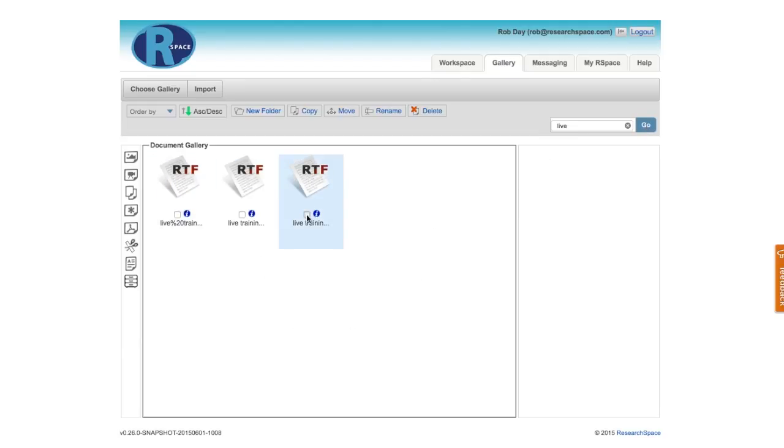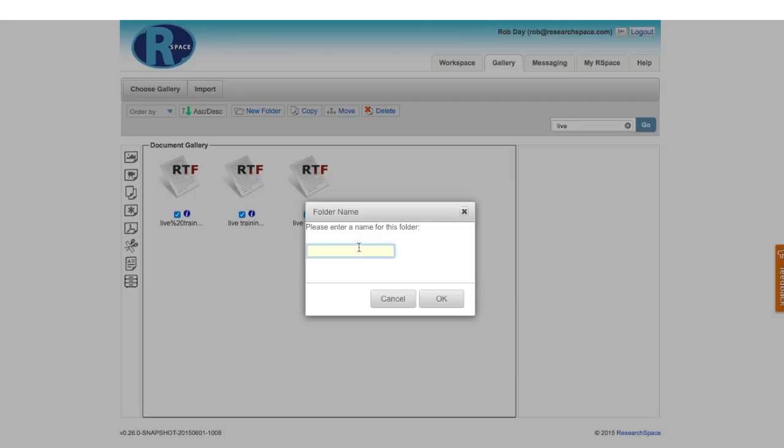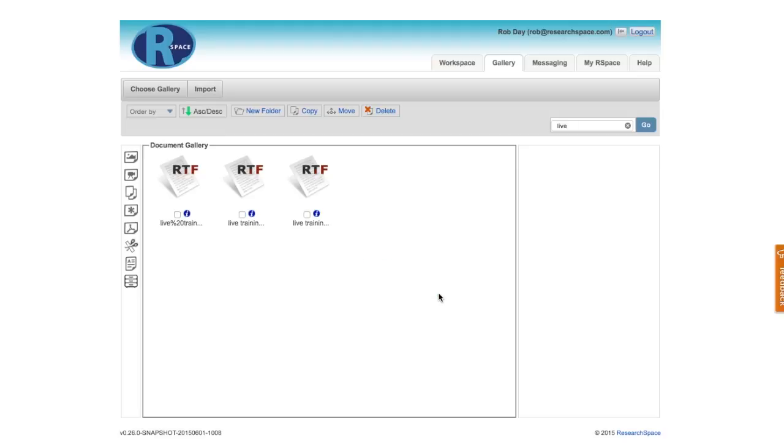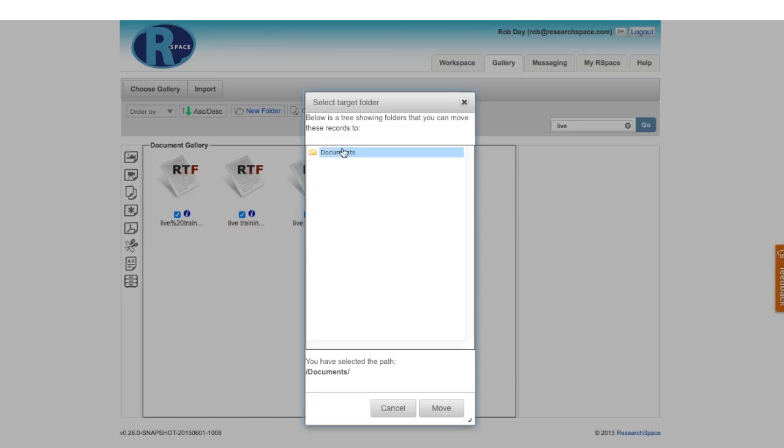I can now select these three files, and I can move them anywhere I want. I could, for example, make a new folder that we'll call RTF. And now I'll select the three files, and I'll move them into the new folder that I just created.